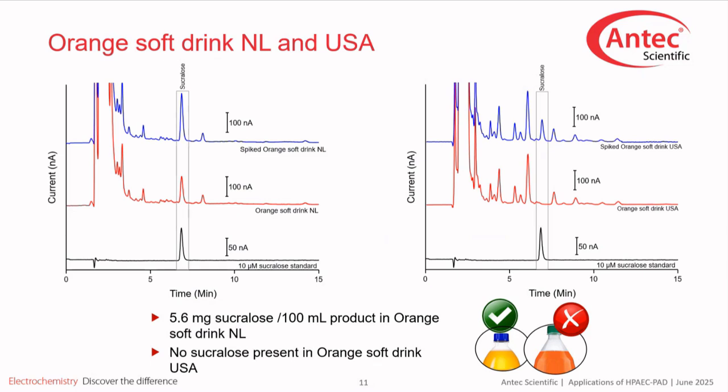So with this slide, we present the analytical results for sucralose in the orange soft drink for various origins and recipes. On the left, you will find the popular orange soft drink from the Netherlands, and on the right, the same brand but from the US.